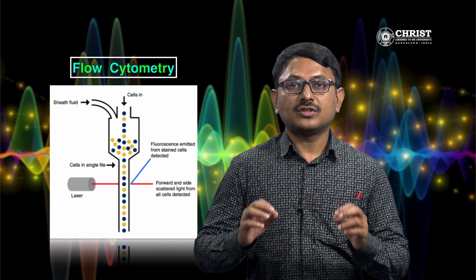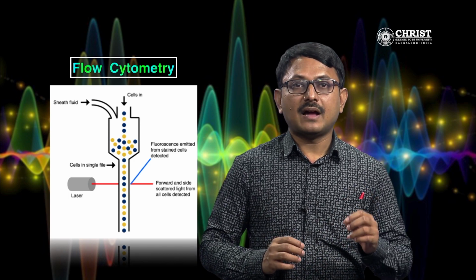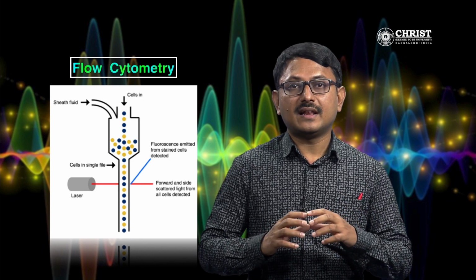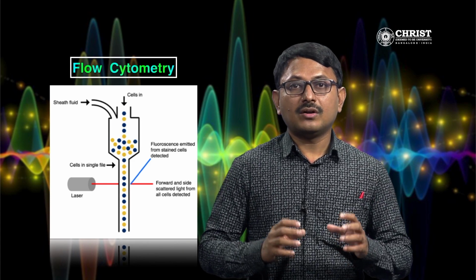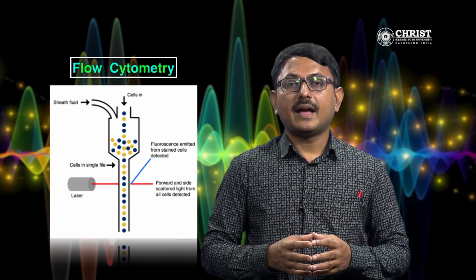A flow cytometer instrument has three main components. They are the fluidics, the optics and the electronics. The term flow cytometry is based on the fluidic flow of particles passing through a quartz chamber, also called a flow cuvette. Particles from the sample are pumped through a flow cuvette in a very narrow stream flowing inside a larger sheath stream of water or saline, which is used to focus the sample stream into the center. Any cell or particle that's 0.2 to 150 micrometers in size can be analyzed.